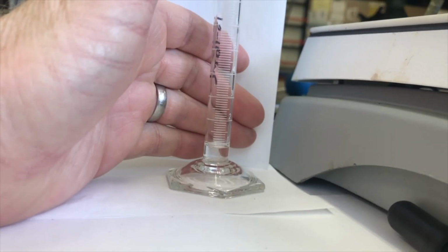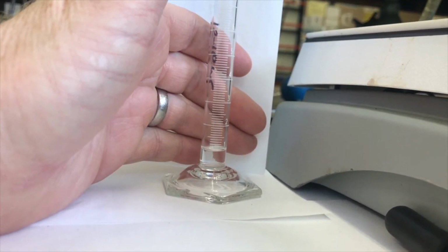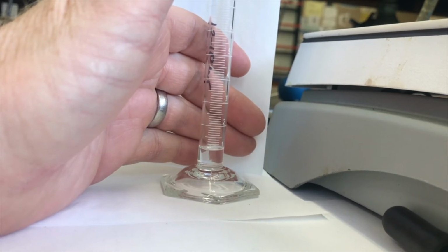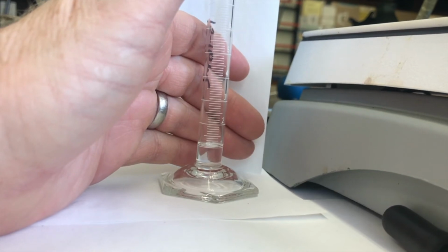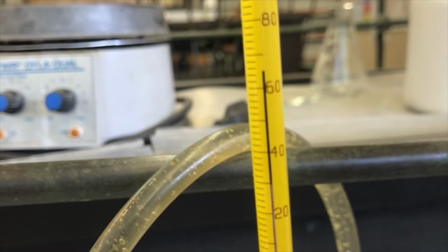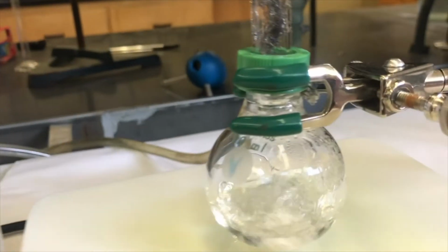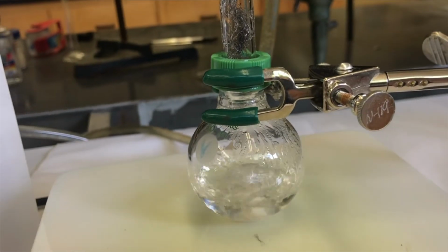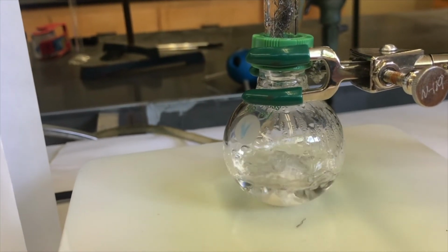Okay, I'm in my fourth graduated cylinder. I'm about to hit the 1 milliliter mark for this one. When I hit that, I'll read the temperature. 1 milliliter. I think we're at, whoa, it's pretty high, huh? 165.